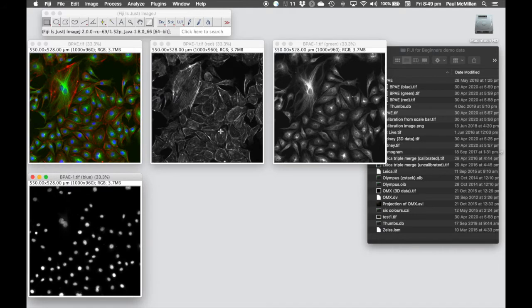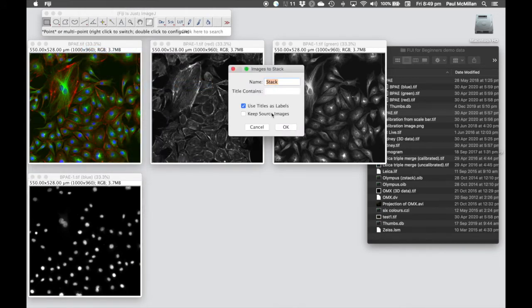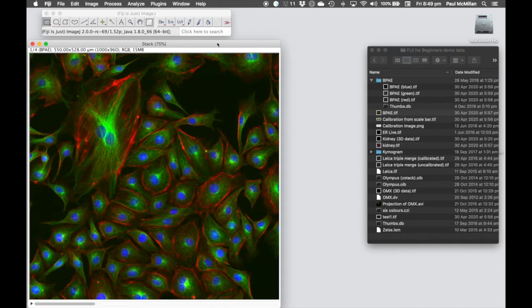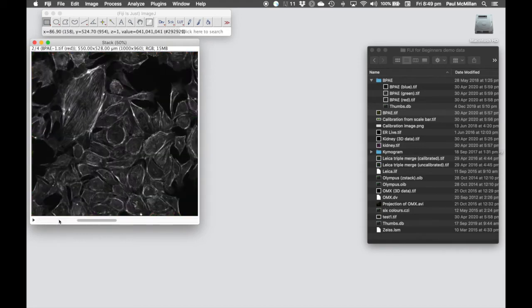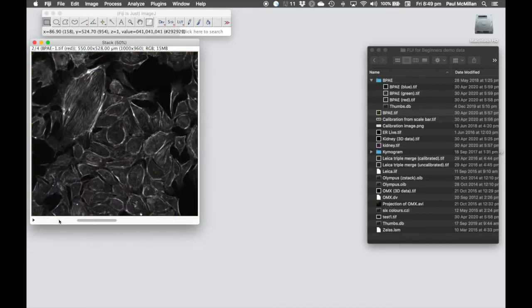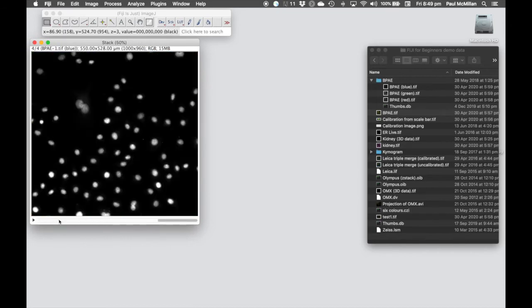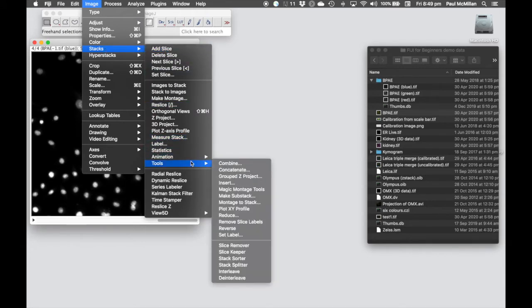Now all our data is in RGB. We want to convert these four images into a stack by going to Image, Stacks, Images to Stack. We name it 'stack' and close the source images. Now we have a stack with four images: the merge at the start, followed by red, green, and blue channels. That's not the correct order we want, so we need to reorder them.